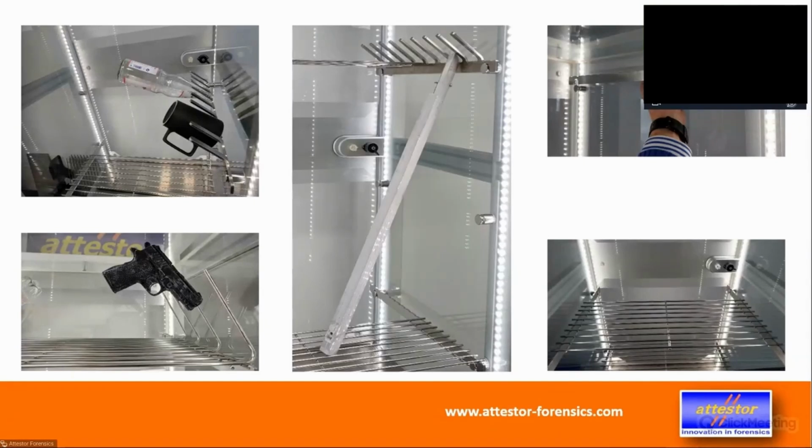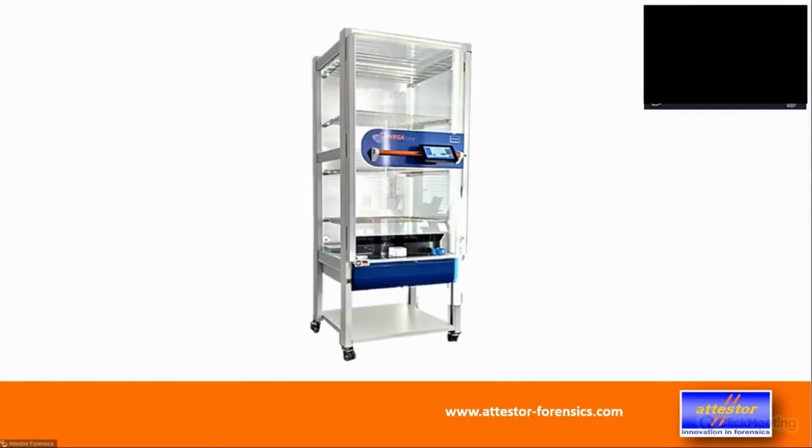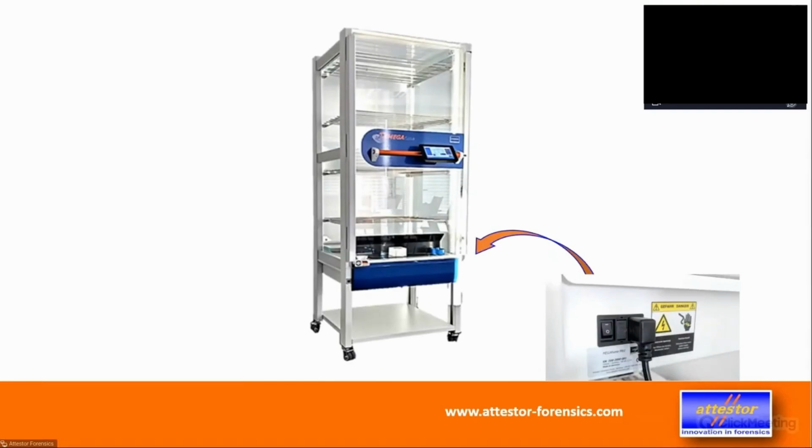Very flexible, and you just simply, as I said, put in what you need, and what you don't need you leave out, with the result you don't have to clean it all the time. So this is the system as you see it here, and I'm going into the details in a minute.